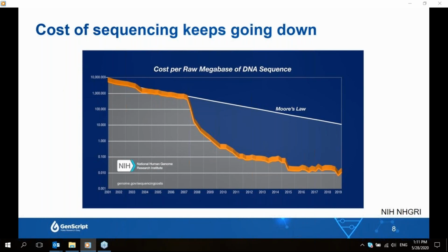There has been a positive feedback loop to me between creating more applications using NGS and better NGS applications driving the technology forward and the price down. So I personally believe that this trend will continue. And equally, I believe NGS will enable us to do even more and greater things.